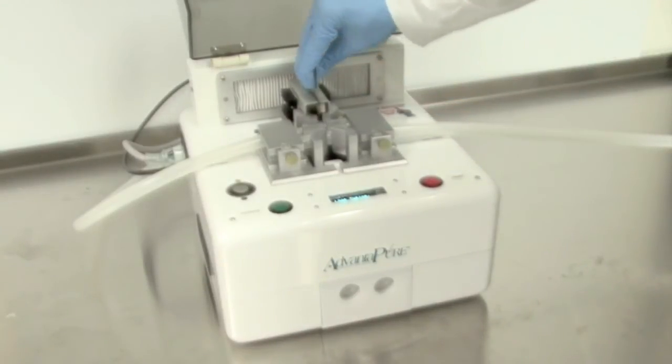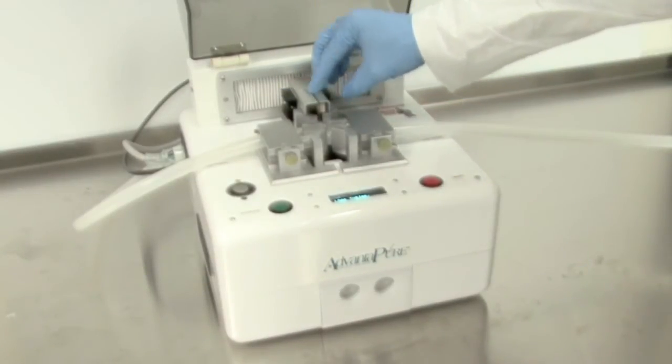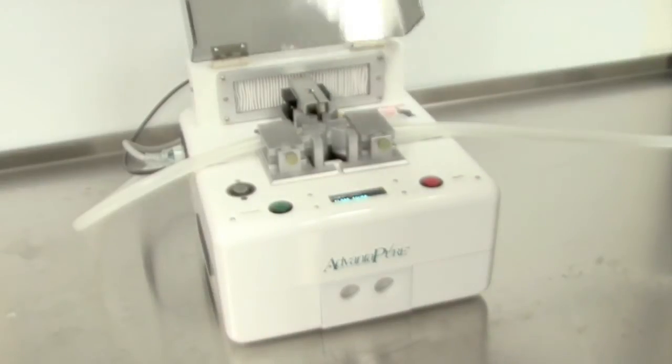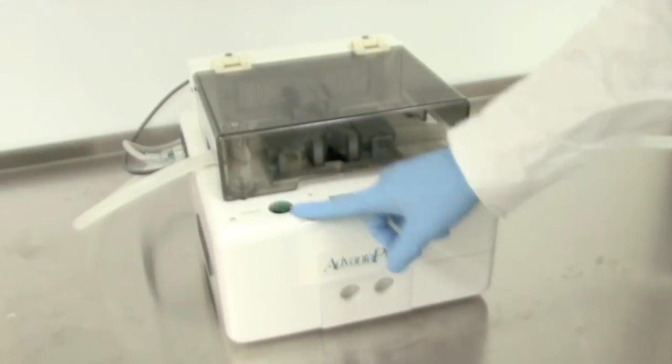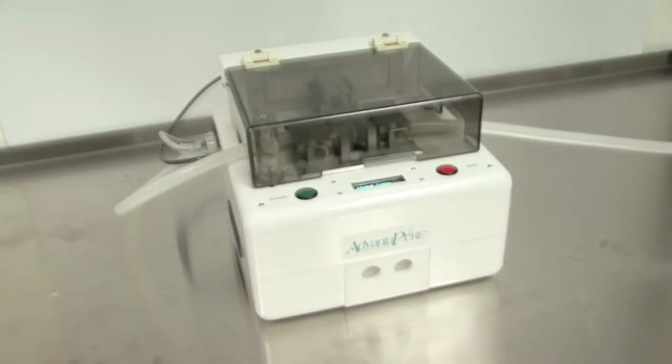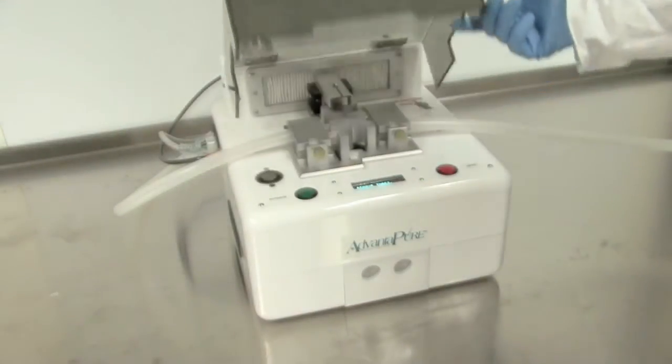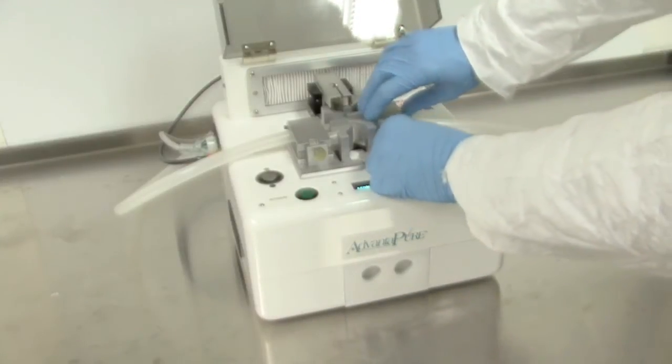Built-in sensors prevent blade reuse. The protective lid is closed and the automated welding process begins with the push of a button. An LCD screen allows the technician to monitor progress and indicates when the weld is complete.